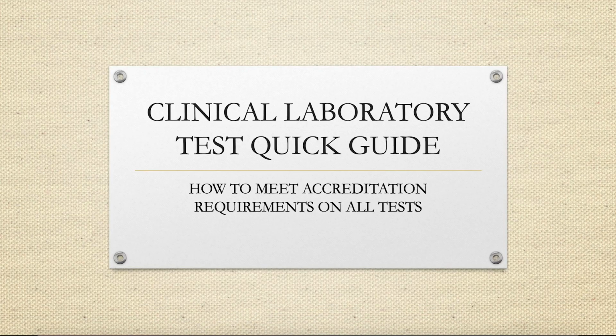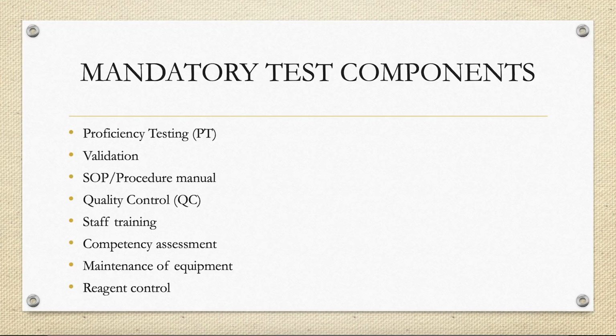Welcome to our topic on Clinical Laboratory Test Quick Guide on how to meet accreditation requirements. We are going to check on mandatory test components, which are validation, SOP or procedure manual, quality control, proficiency testing, staff training, competency assessment, maintenance of equipment, and reagent control.